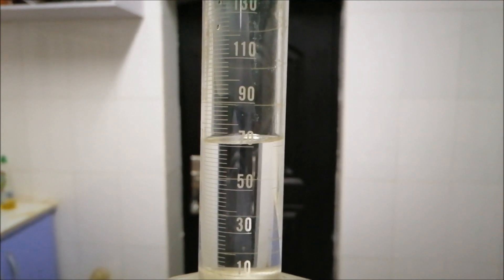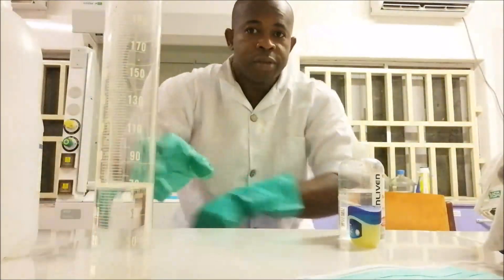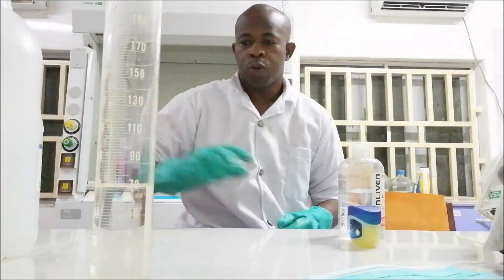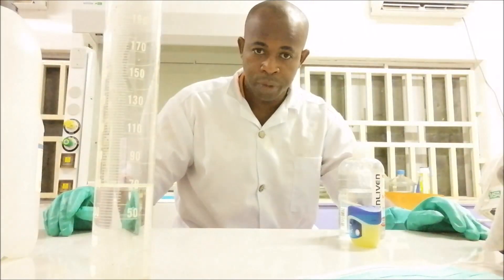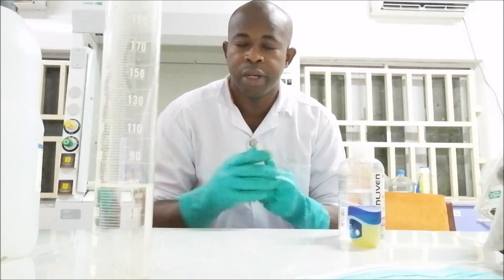Glycerol is a humectant — a chemical that prevents drying and keeps your hands moisturized. So you have 70ml of ethanol in the measuring cylinder. The remaining volume up to 100ml should be any humectant of your choice: glycerol, olive oil, or coconut oil. In commercial industries they use glycerol to moisturize and prevent the hand from drying due to alcohol.